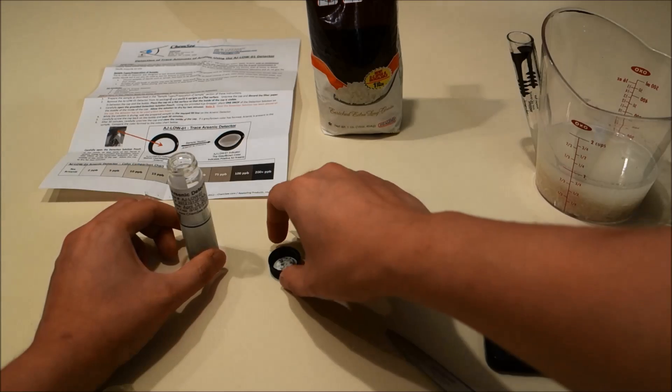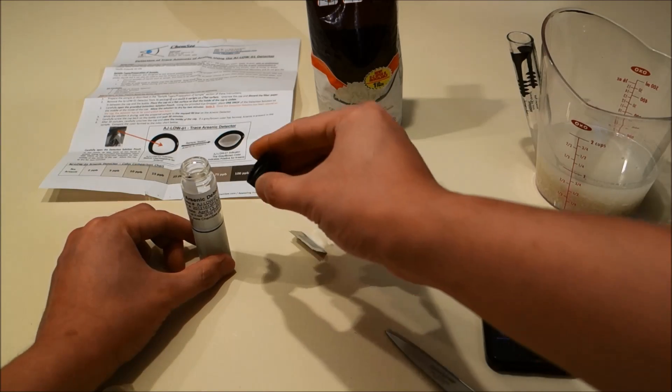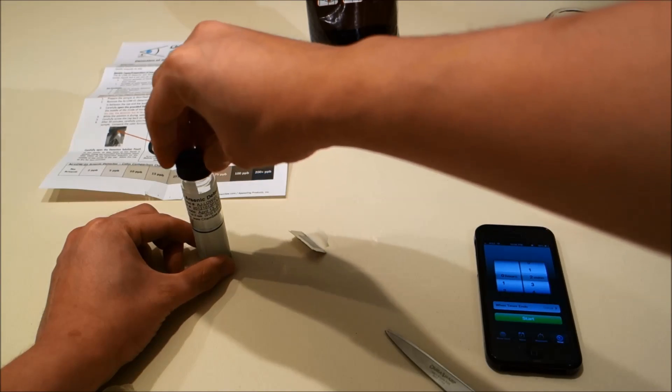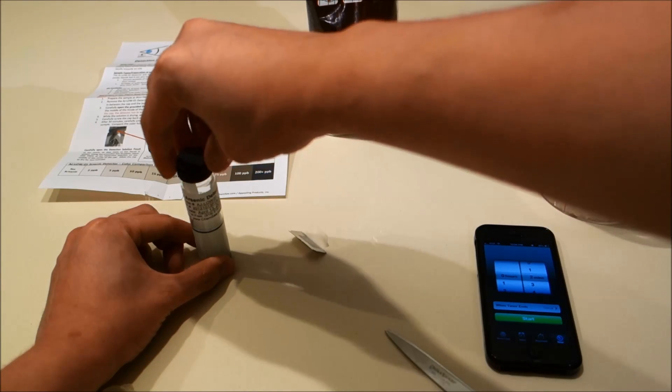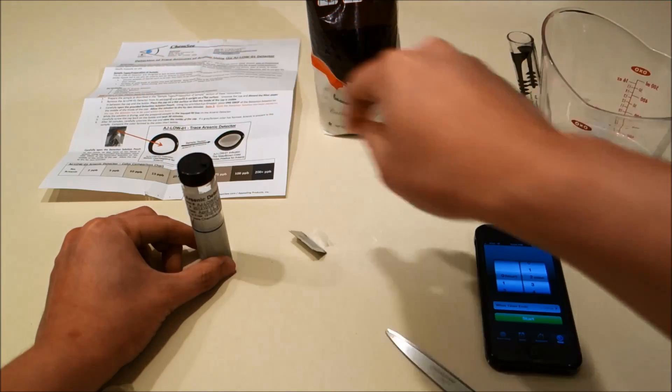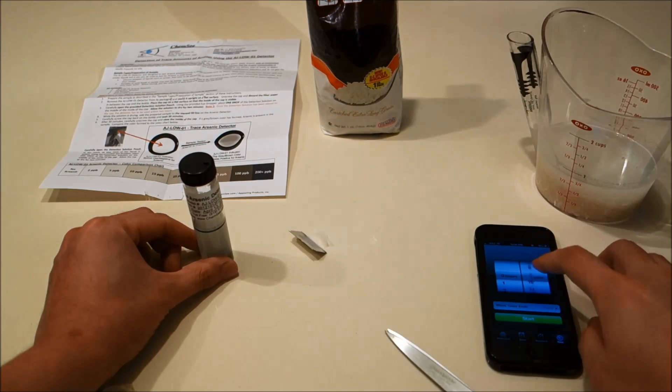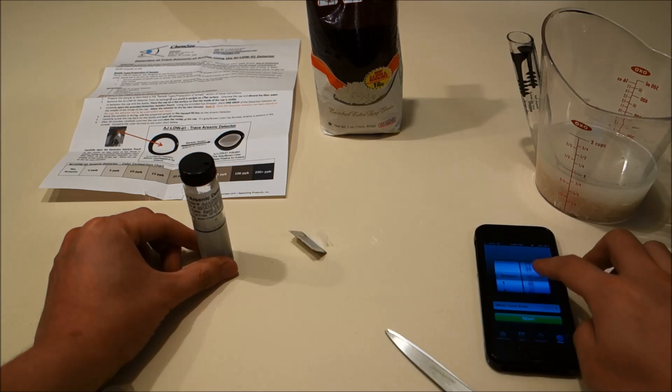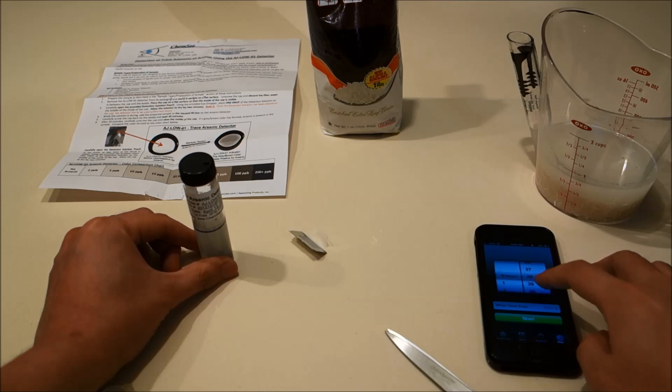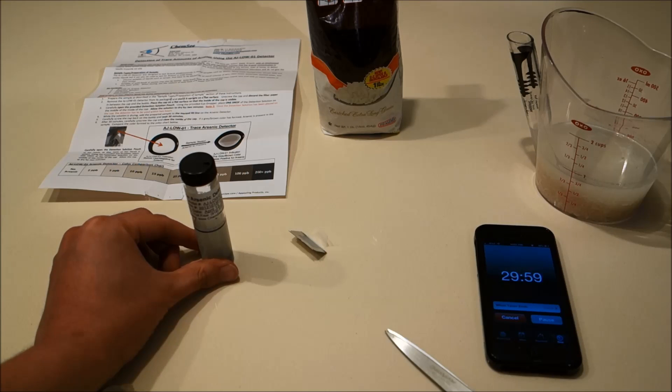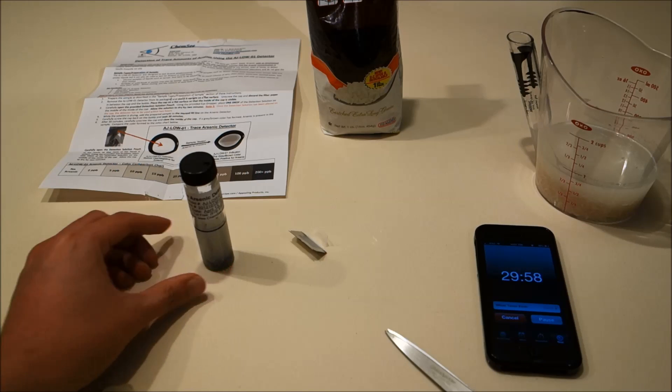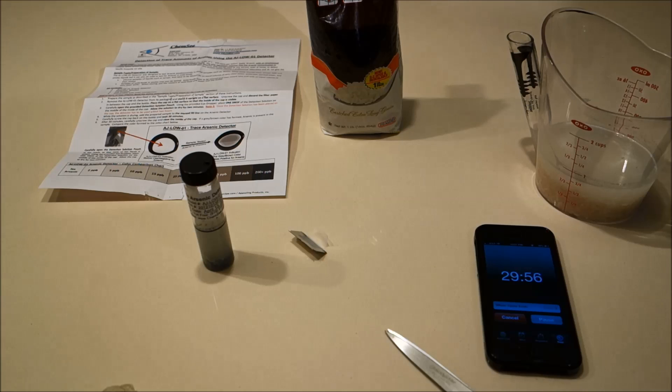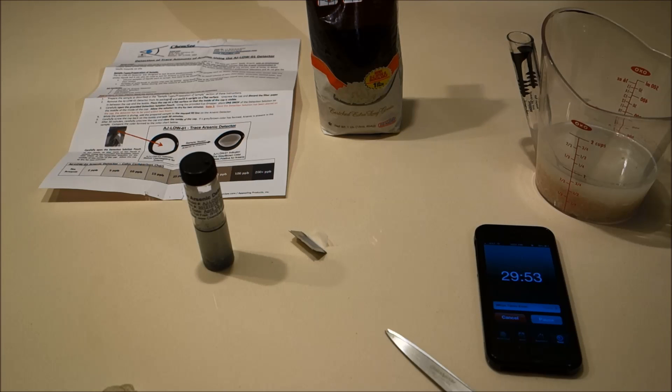Now we're going to screw the detector cap carefully back onto the vial and let that sit for 30 minutes. Now again, it's very important that you do not shake or disturb the vial in any way or the test results will become invalid.